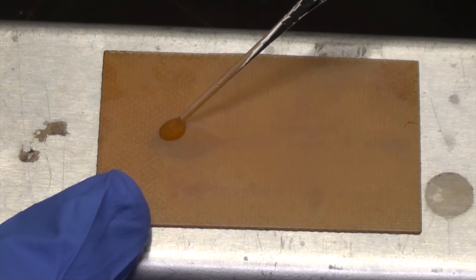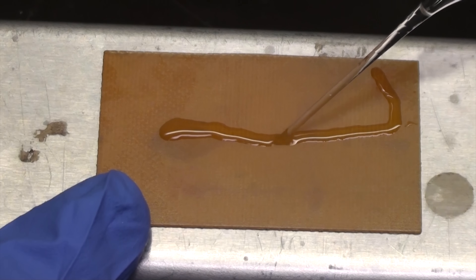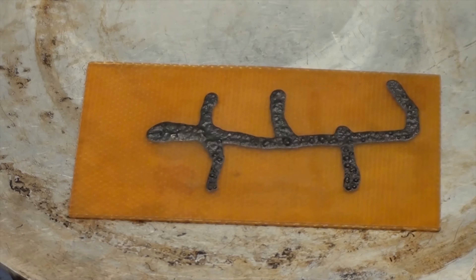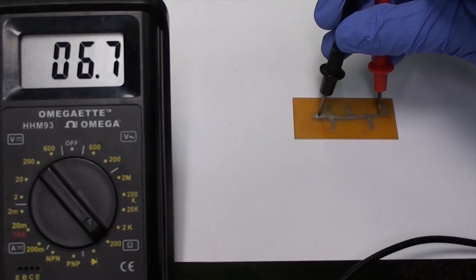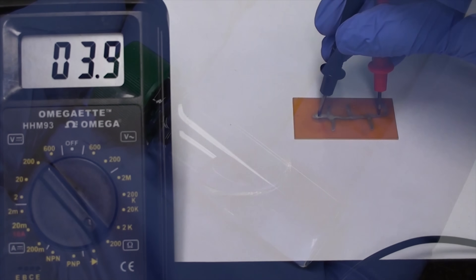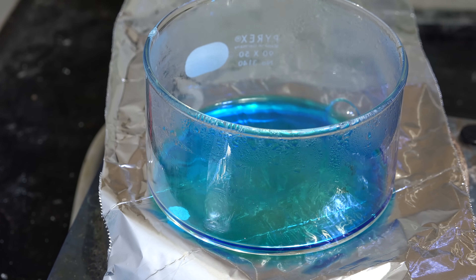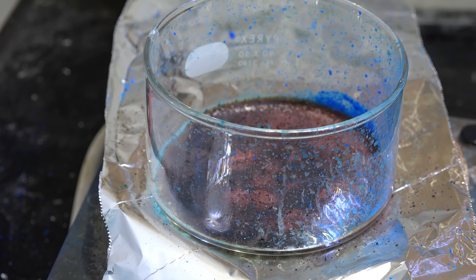Greetings fellow nerds. Some years ago I made silver conductive ink — a liquid that when applied to a surface and then heated would decompose into metallic silver that was conductive. A number of electrical engineers have asked me if there was a copper analog of the same substance. While it's not an exact analog, in this video we'll make copper formate, a useful precursor to copper conductive ink.